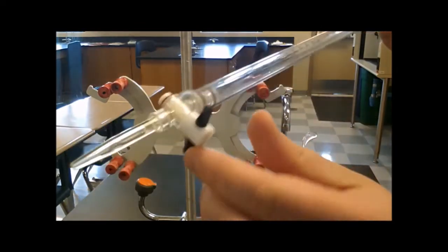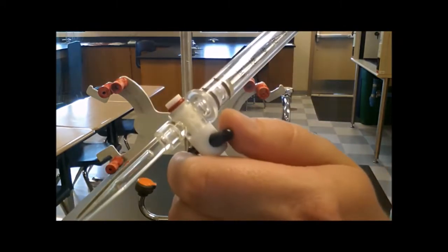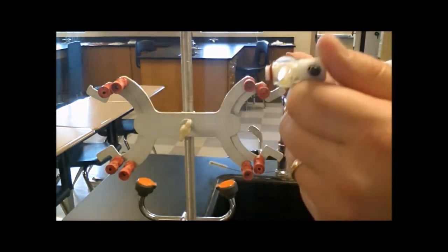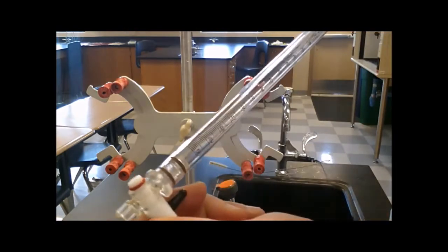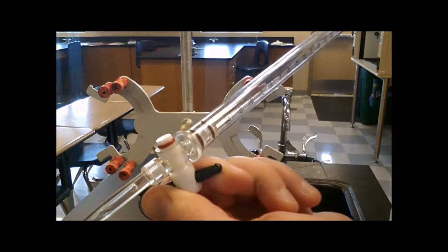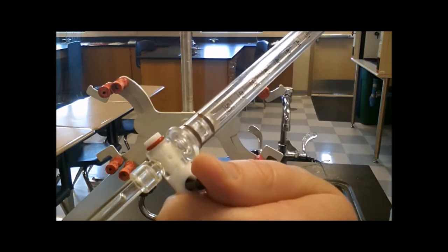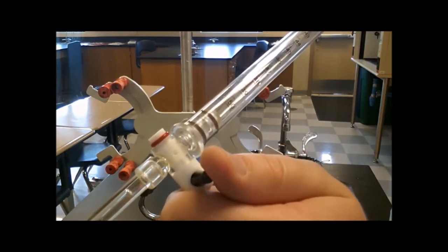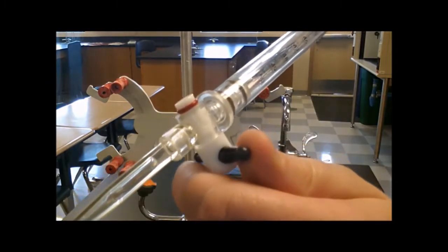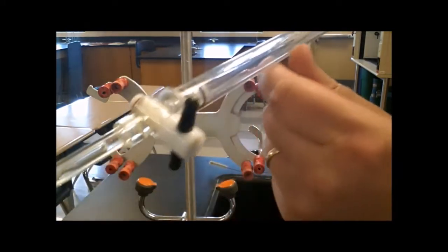The Buret has open and closed. You can see there's a hole inside, and this thing is called the stopcock. When you open the stopcock, the hole is aligned with the tube and the opening down here. When you close the stopcock, you'll notice that the hole that goes through the plastic, where the liquid flows through, is perpendicular to that, and so that's closed. So open is parallel and closed is perpendicular.